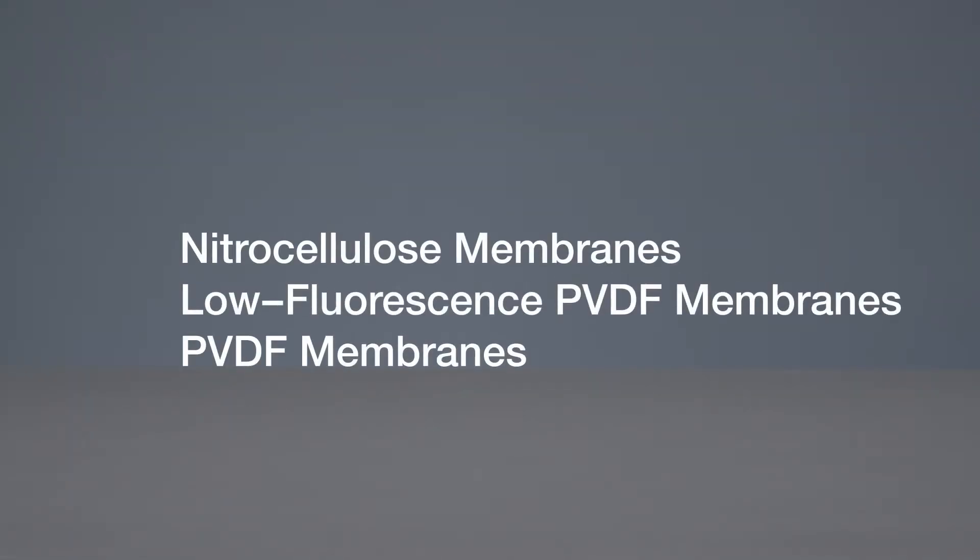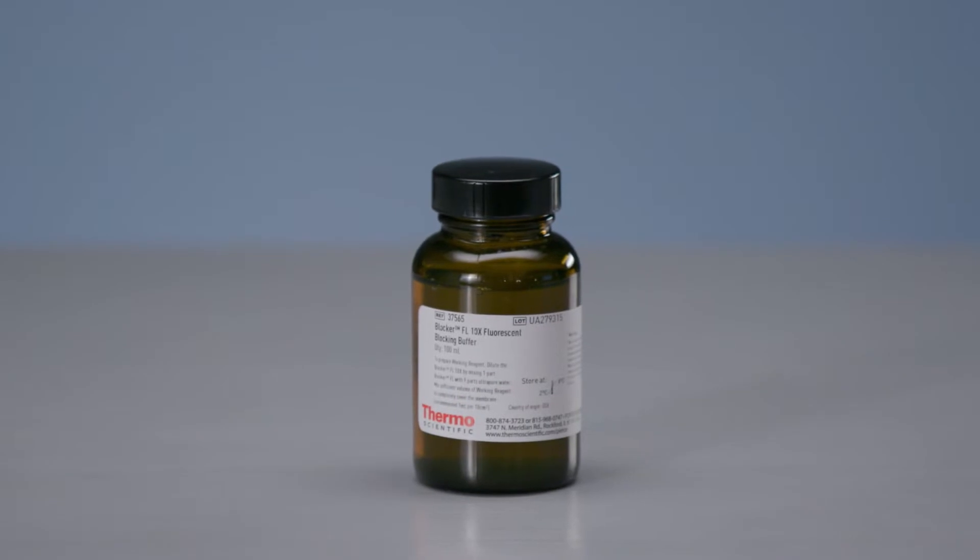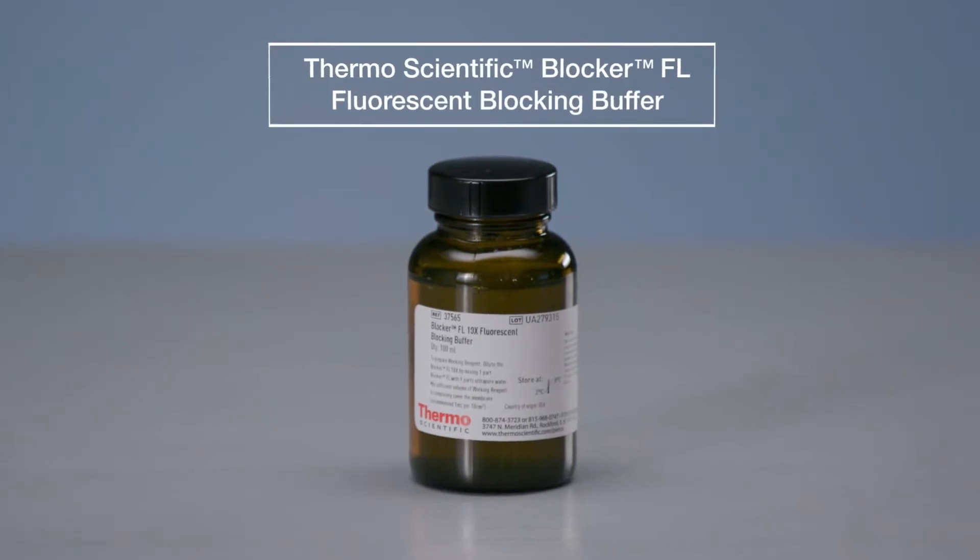To eliminate a major source of background fluorescence, use membranes with low autofluorescence such as nitrocellulose and low fluorescence PVDF membranes. Additionally, particles and contaminants in blocking and wash buffers can settle on membranes and create fluorescent artifacts. Use high-quality filtered buffers such as Thermo Scientific Blocker FL fluorescent blocking buffer.